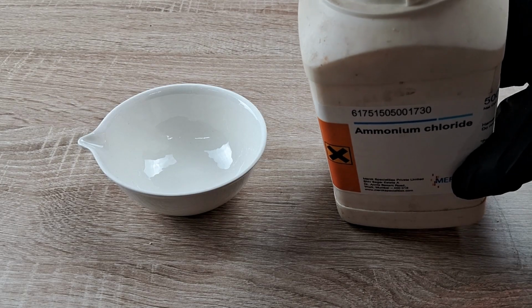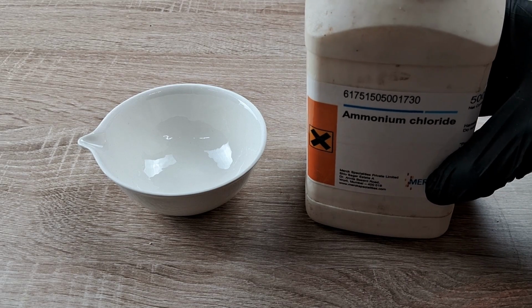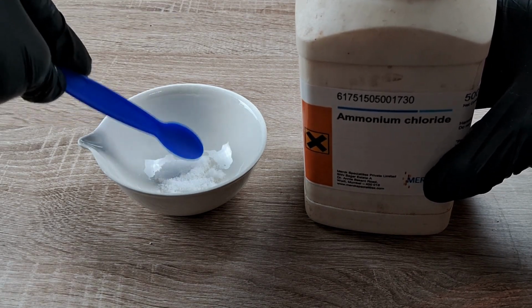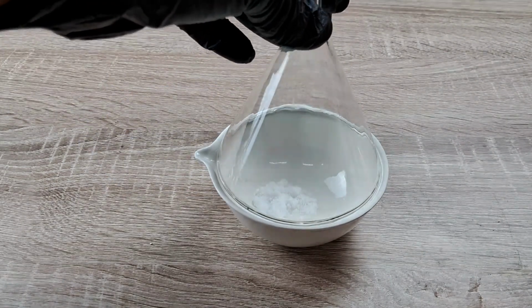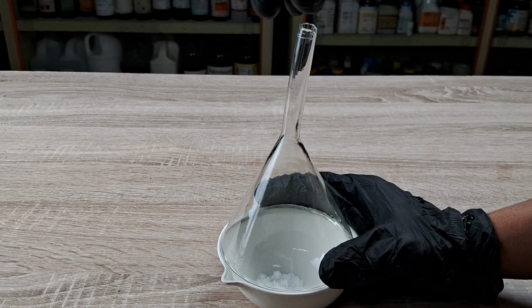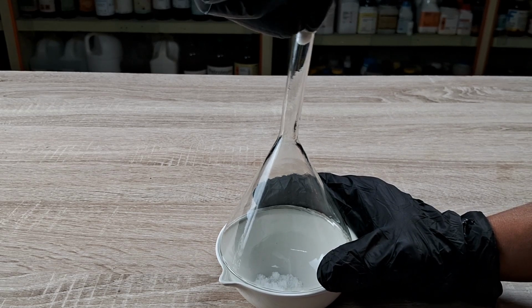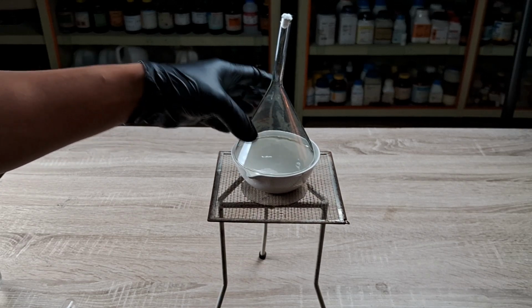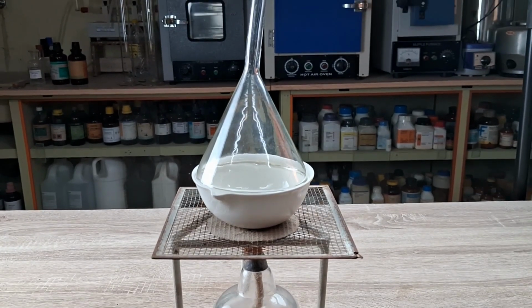To perform the reversible decomposition reaction of ammonium chloride, take one spatula full of solid ammonium chloride crystals and place it in a china dish. Cover it with a glass funnel. Plug the stem of the funnel with a small piece of cotton or glass wool. Place this setup on a wire gauze in a tripod stand and heat the ammonium chloride slowly using a spirit lamp or Bunsen burner. Watch closely.